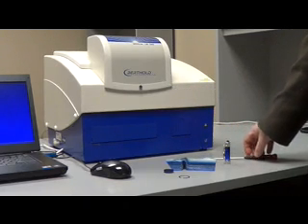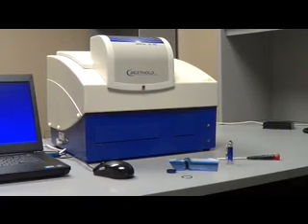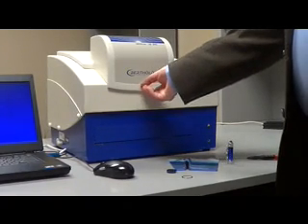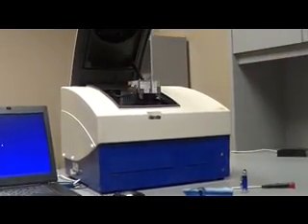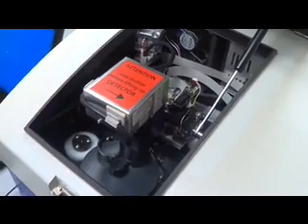With the instrument off, the first thing you need to do is loosen the screw and lift the cover.